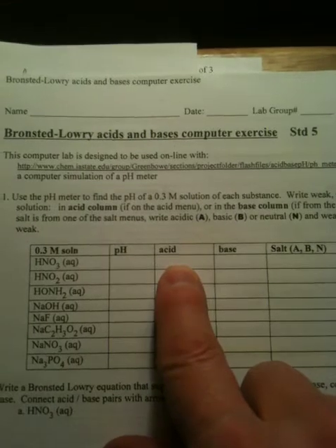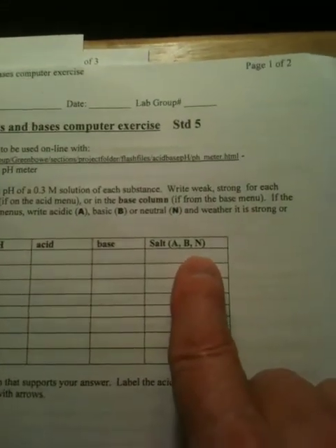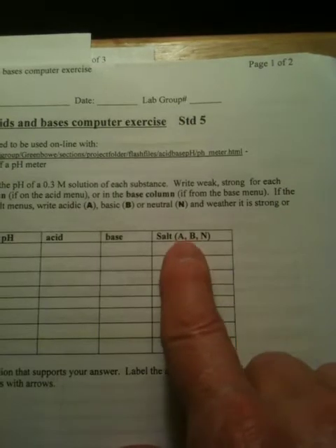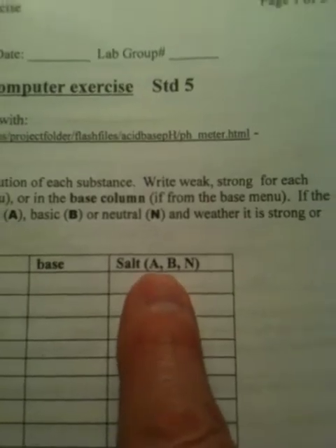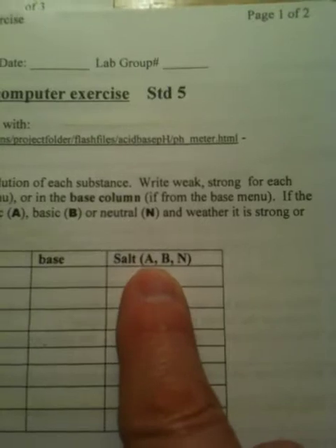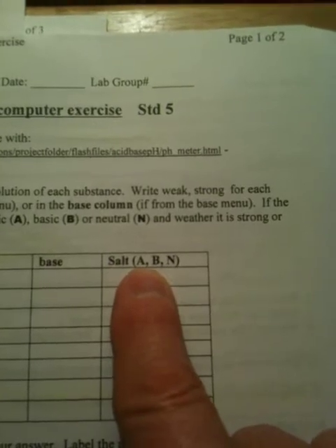And why is it a strong acid? Because it's on the strong acid list. It wasn't on the base menu, and it wasn't on the salt menu. Actually, there are 3 salt menus, and for anything from any one of those 3 salt menus, you're going to record here whether it is an acid or a base, and you tell that by the pH. If the pH is above 7, it's going to be a base. If the pH is below 7, it's going to be an acid.